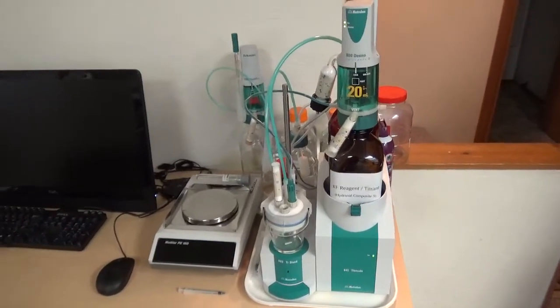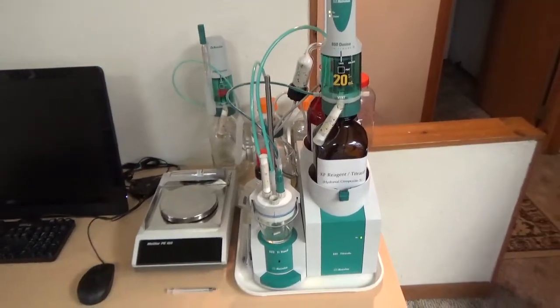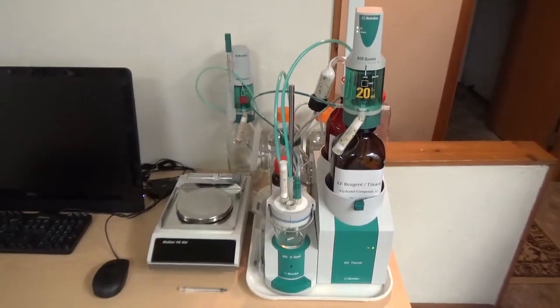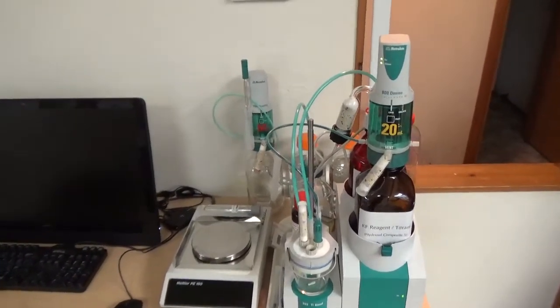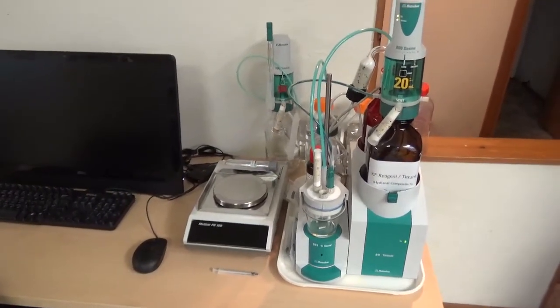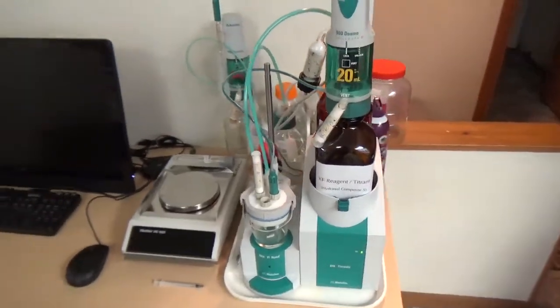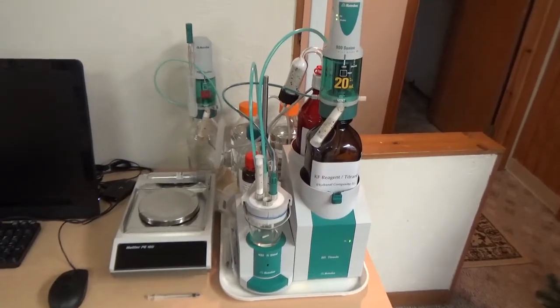We keep a small concrete sample in an ethanol solution in a sealed container for days. By solvent extraction, we remove the moisture from the pore spaces of the concrete into the ethanol, then take that ethanol as a sample to determine the moisture content. We use Hydranal Composite 5 as the Karl Fischer titrant reagent, and since we are doing ethanol substitution for concrete moisture content, we use ethanol as the solvent. We also have a waste container for the titration solution after titration.